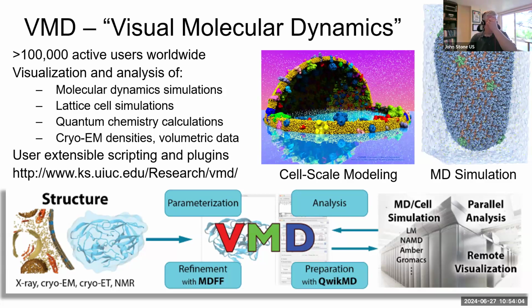So as you can imagine, if you imagine doing a Google search, you could do 1,000 clicks to find something, or you can just ask Google to find it for you. There's an analogy there between how you find things on the internet at large, with a large set of data or a database query, and what we do in VMD when people select atoms or structures that meet some criteria.